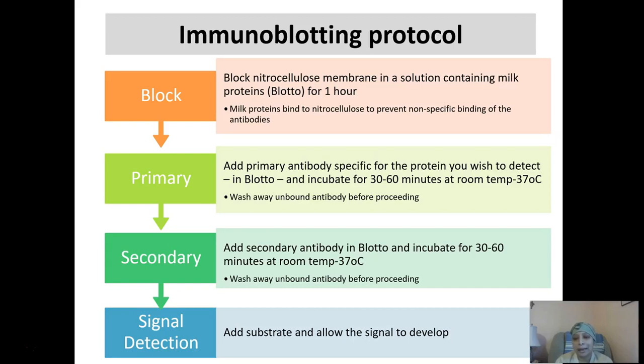You want to keep that for at least an hour typically. Sometimes 30 minutes is enough if it's a very good specific antibody. But it is better if you use at least 60 minutes. I usually put my primary antibodies on either for 2 hours or overnight for best detection. Then we're going to wash away the unbound antibody before proceeding to the second step.